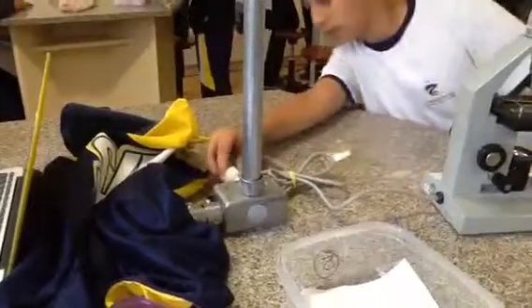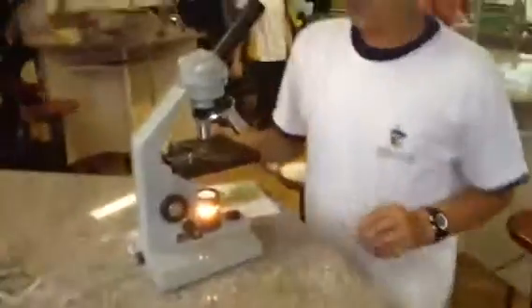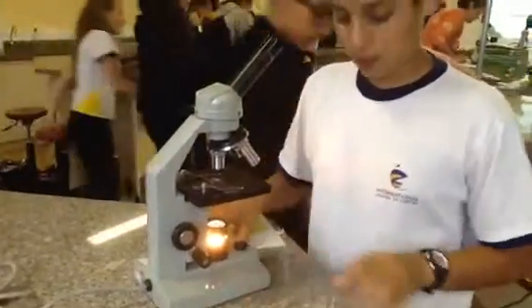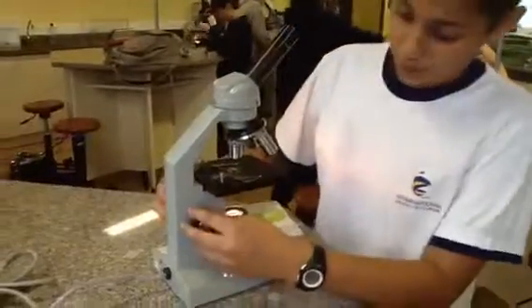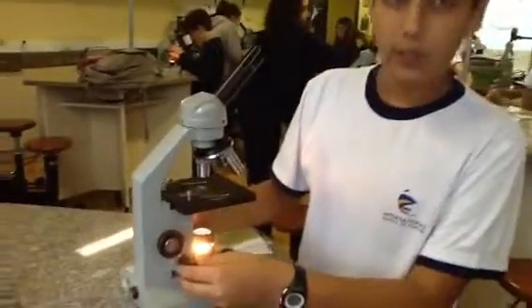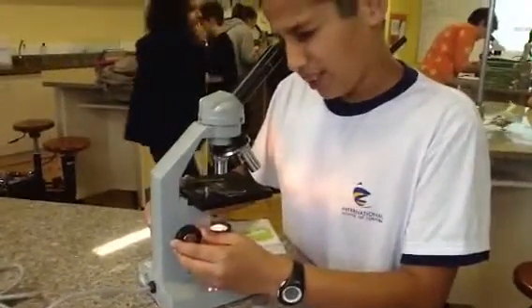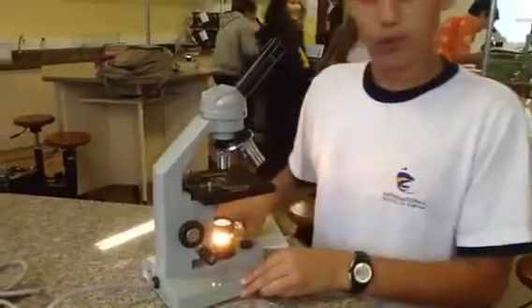You want to make sure it's plugged in, then turn on the lights. At the beginning it gets a little bit harder to see, so you're going to want to use your coarse adjustment knob and your fine adjustment knobs over here to try to focus, make it in view, and find the specimen in center view.